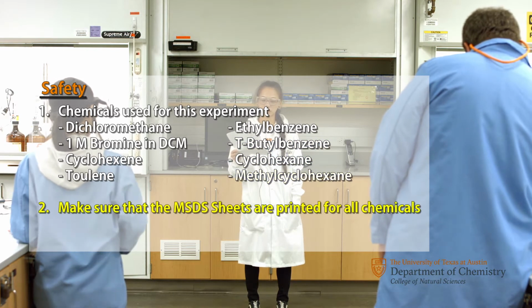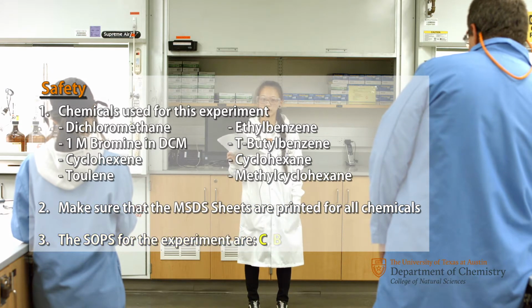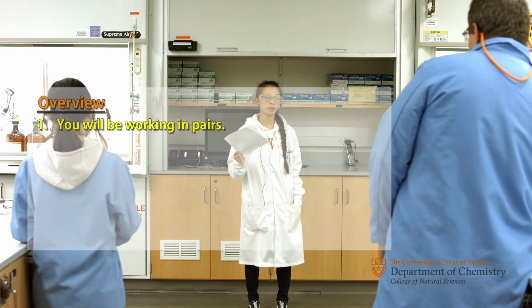Make sure that the MSDS sheets are printed out for all these chemicals. The SOPs for this experiment are C, B, G, D, and H. Today you'll be working in pairs.